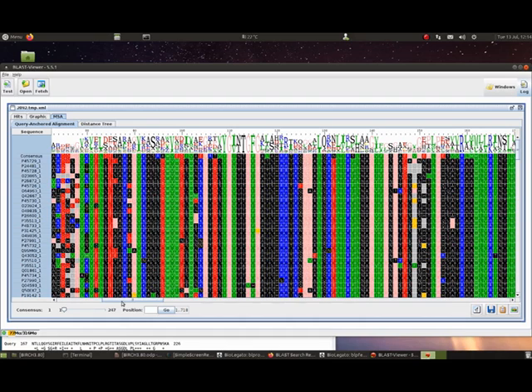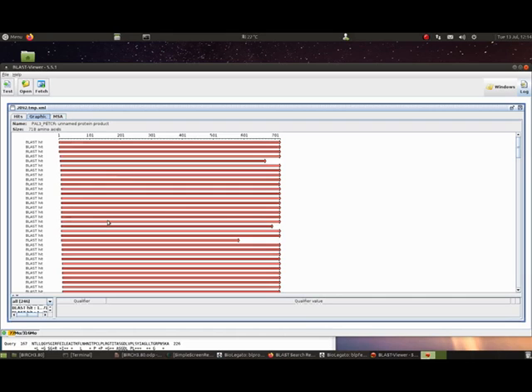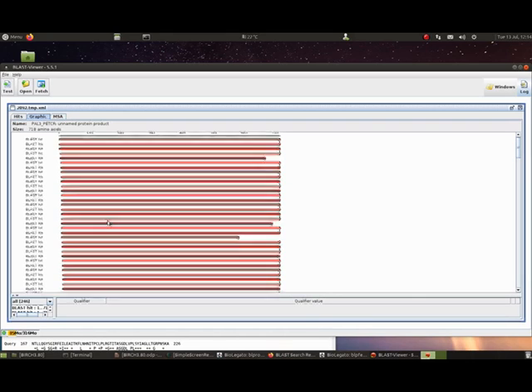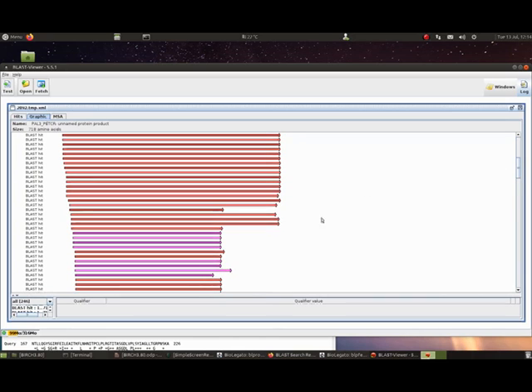Based on these kinds of results, I often find the graphic results to be the most useful, and so I might want to choose, let's say, only those that are going to give me more or less a full length output. That would be up to this sequence Q68G84, because I've selected that particular one.